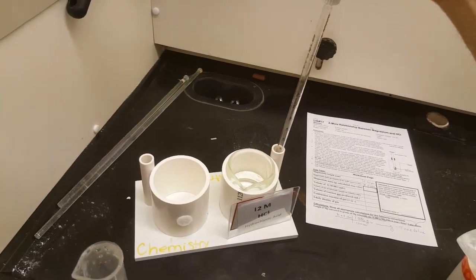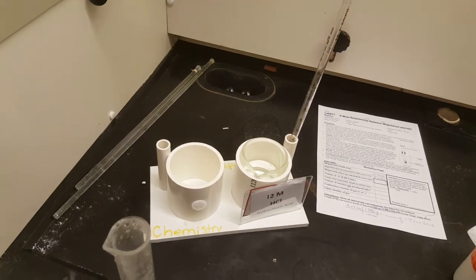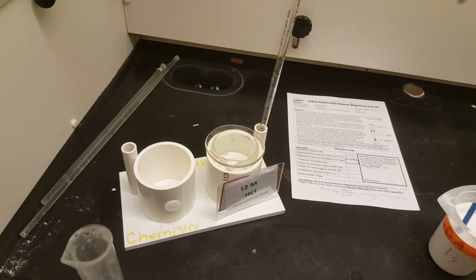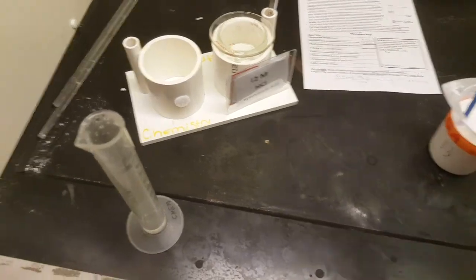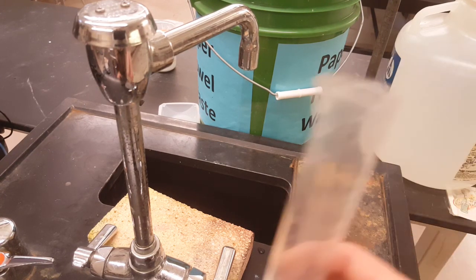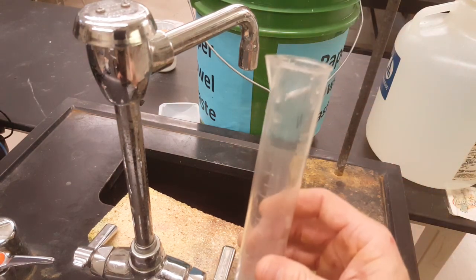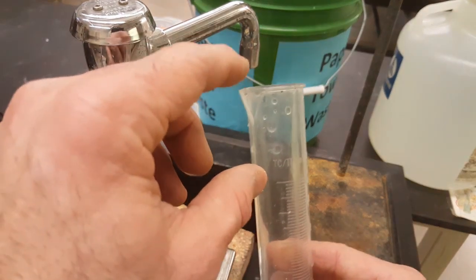Replace the pipette into the cylinder next to the reservoir and put the watch glass back on. Now if you spilled anything, use the baking soda to neutralize the acid. For the next step, you want to fill with the acid at the bottom. You want to fill this graduated cylinder all the way up to the tippy top.